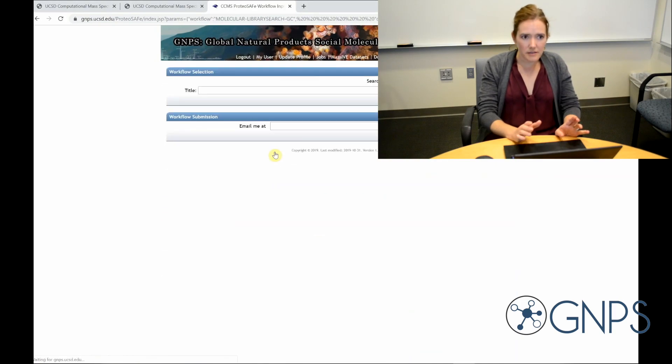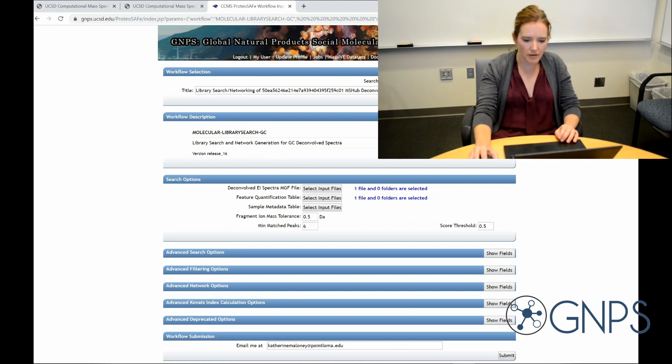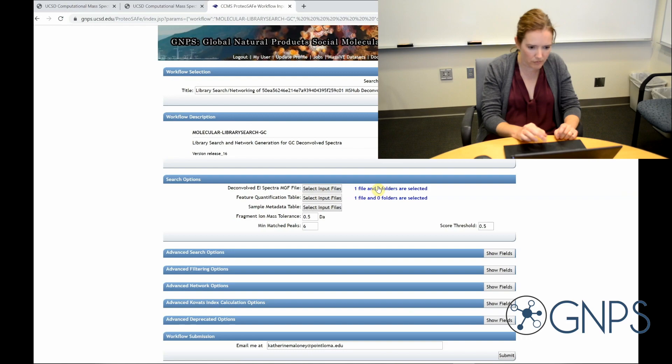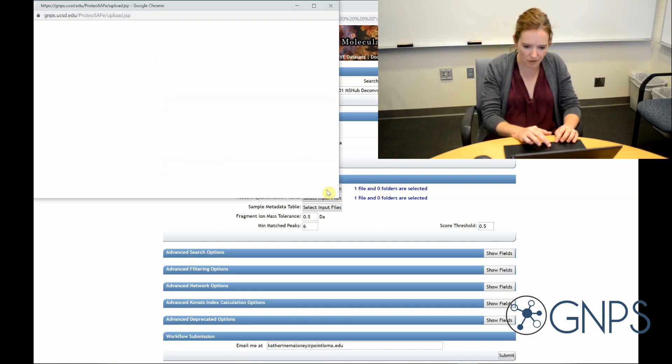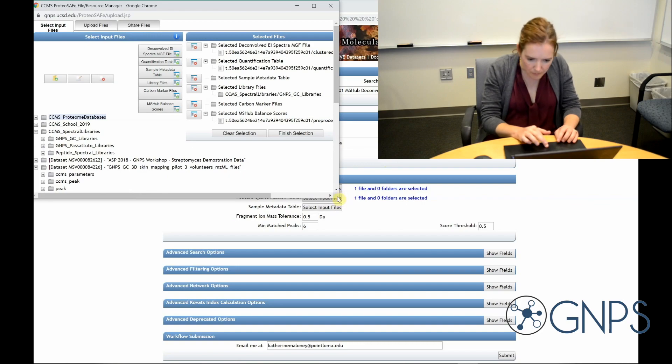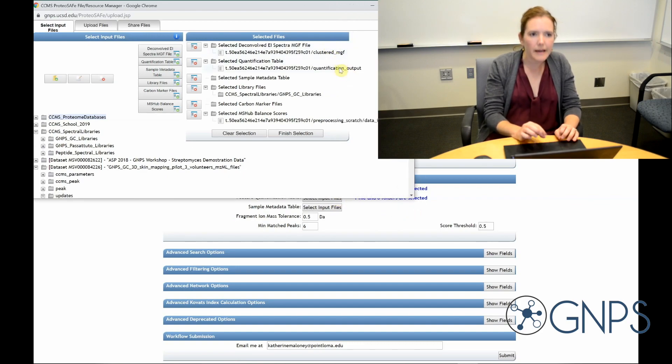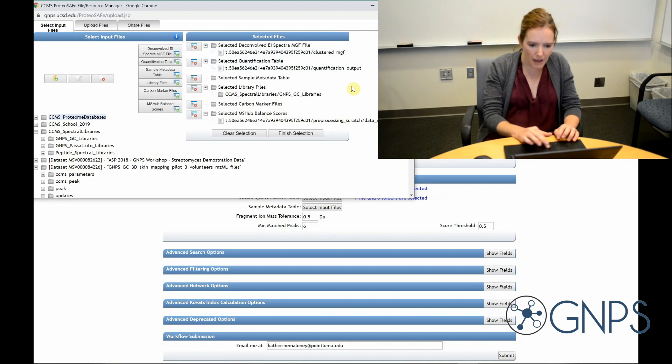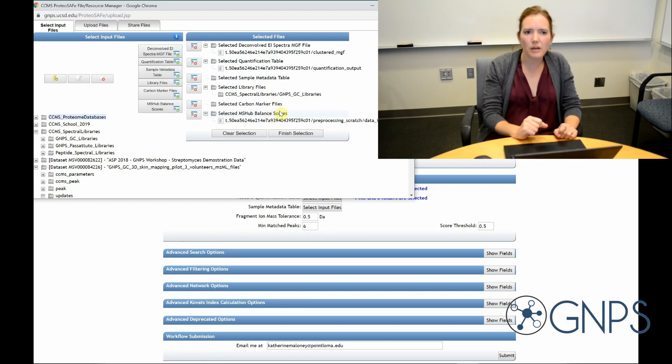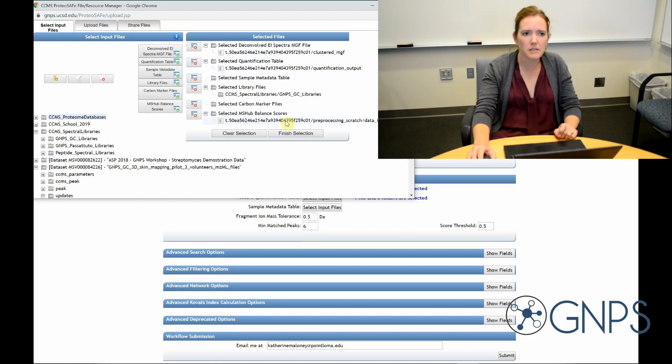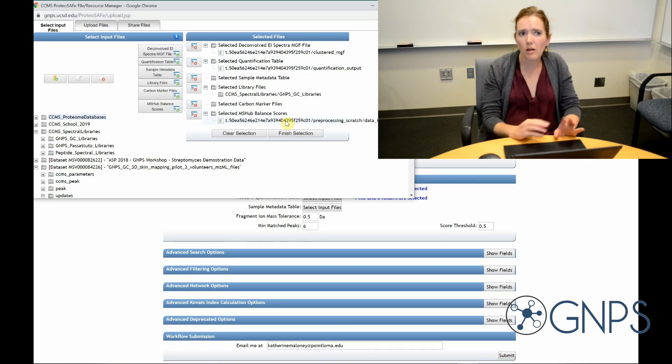This creates a GNPS job and it's automatically supplying the mgf file and feature table files that I generated before. So we can see here, if I click select input files, here's that mgf file from the deconvolution along with my quantification table. Because I used mshub for the deconvolution, it also supplies information for something called balance scores. The balance score gives information about the consistency of the spectral pattern across my data. So if I have a high balance score, that indicates that the spectra are reproducible. A low balance score indicates that the spectra are inconsistent or change from sample to sample. And that's an indication that they might just be noise. If I were to perform the deconvolution using a different tool, I don't have to supply this information.